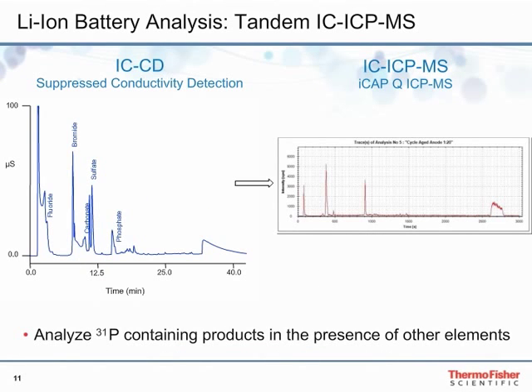In order to confirm the findings previously presented, the same separation was performed using inductively coupled plasma mass spectrometry as a detection system, instead of the high-resolution mass spectrometer used in the previous example. Although IC-MS is not able to provide structural identification for a given compound, it can unambiguously indicate the presence of a given element, in this case phosphorus, and quantify its exact amount.